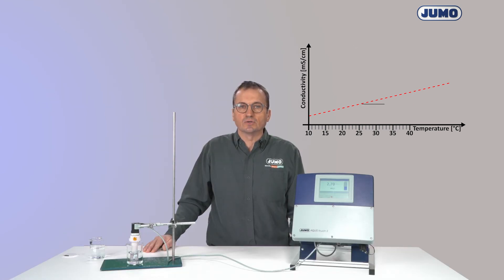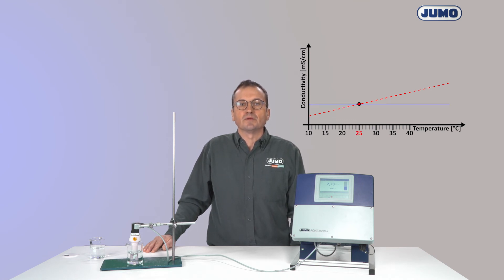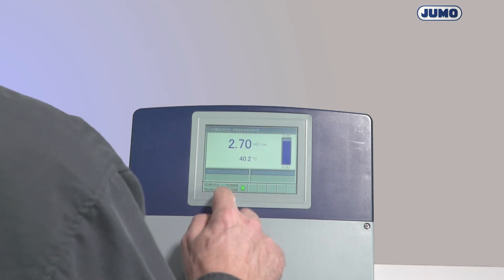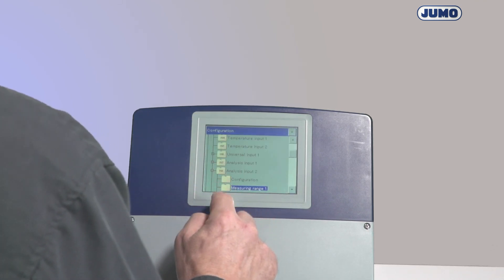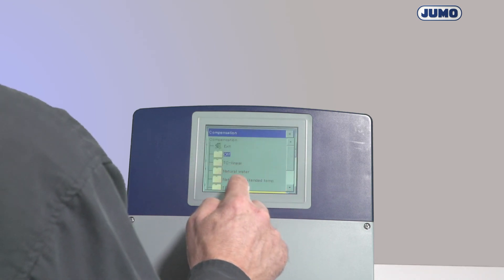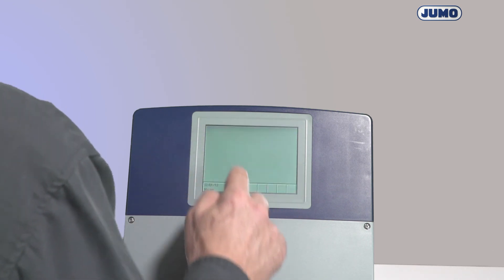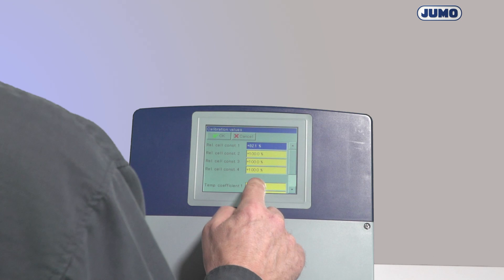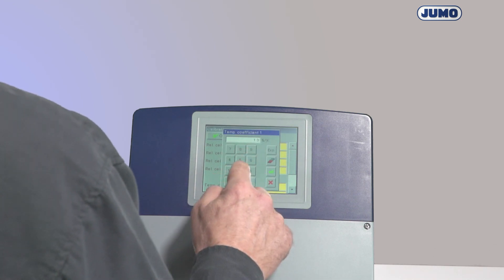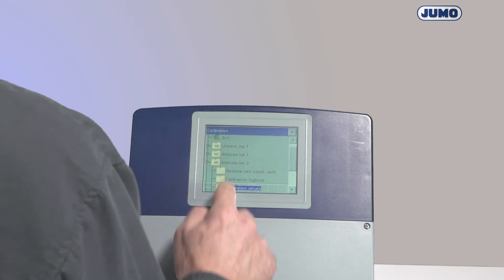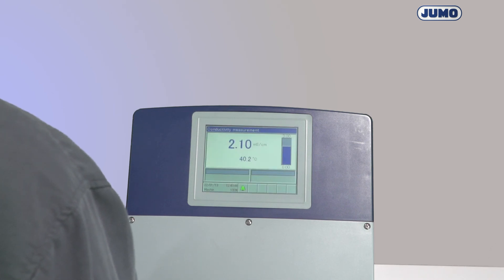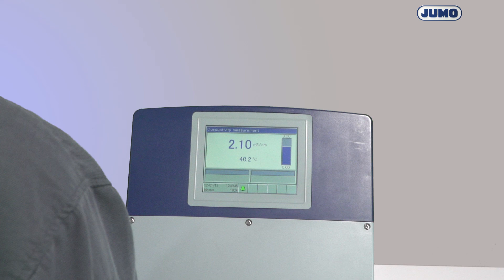With the help of the temperature coefficient, the transmitter will determine the compensated conductivity from the measured uncompensated conductivity and the present temperature. I activate the linear temperature compensation again on the transmitter and I enter the determined temperature coefficient. The transmitter now shows me the compensated conductivity. If measurements are always taken in the same solution, I only have to determine the temperature coefficient once and enter it in the transmitter.